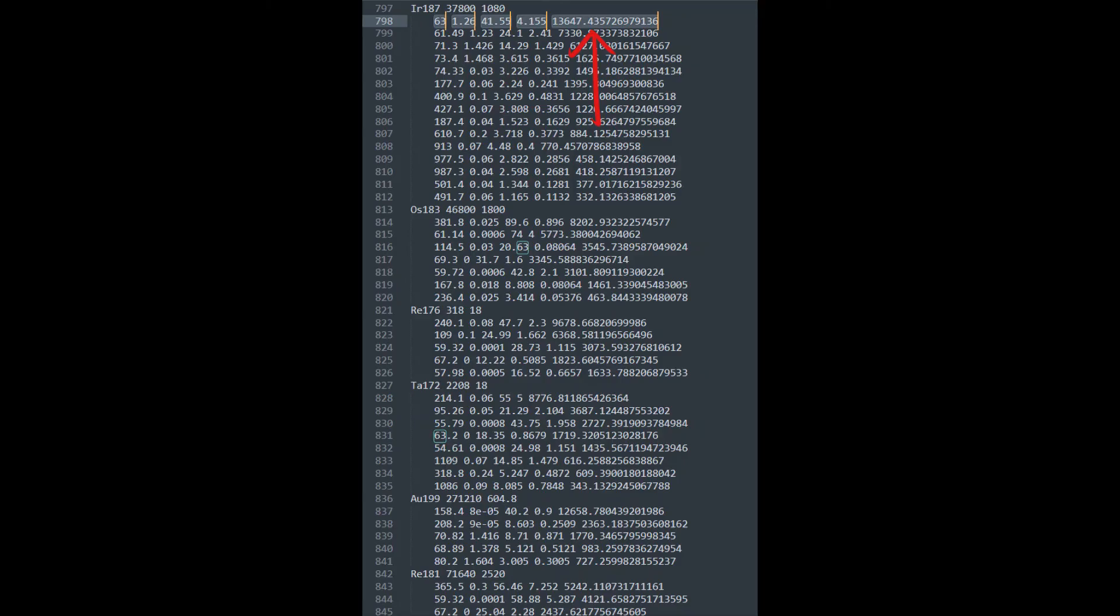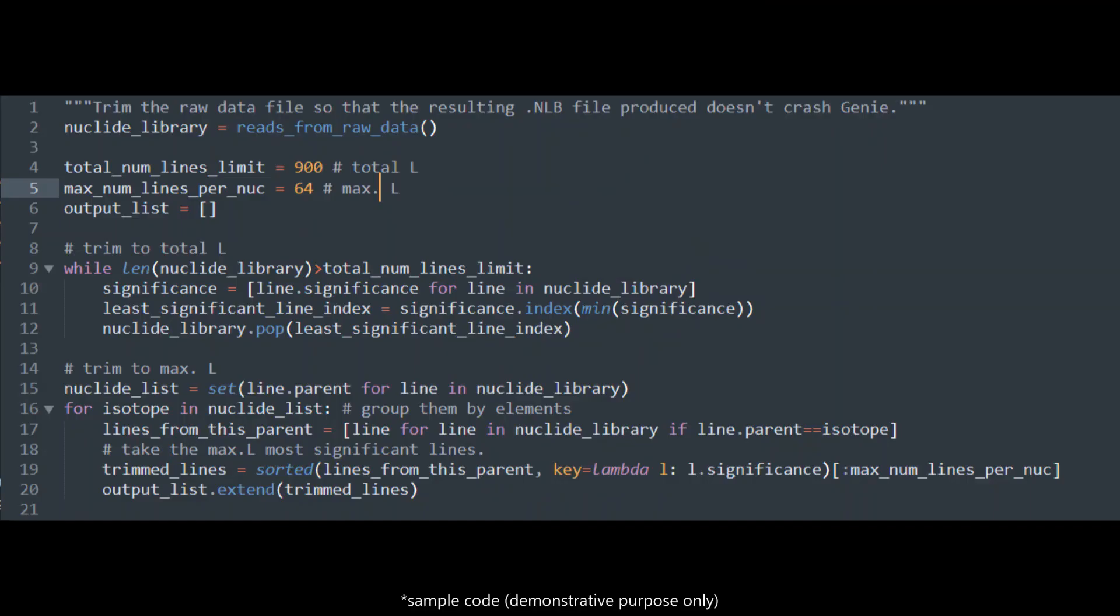Obviously you would want to only trim away the least significant and least detectable lines from the .NLB files. I've chosen to use expected number of counts as my measure of significance. I use a Python script to trim away the least significant lines from the raw data until the widest nuclide doesn't exceed 64 lines wide and the total number of lines from all nuclides doesn't exceed 900.